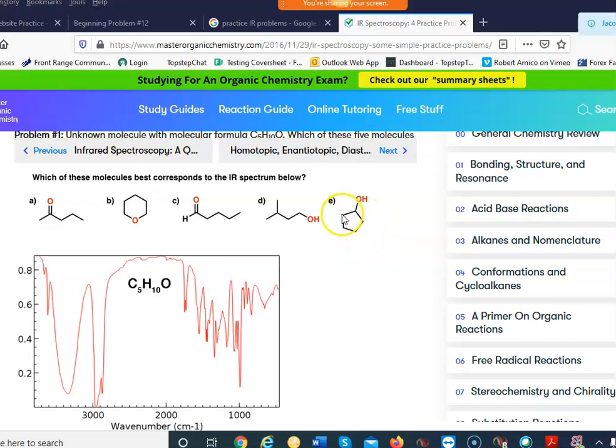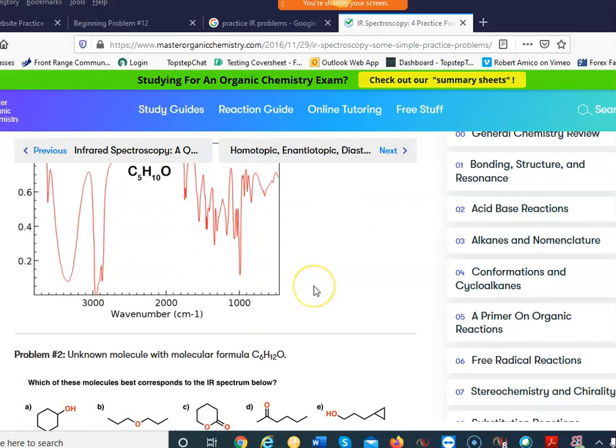It'll tell you if you have a cyclical ring, or if it's a straight chain or something like that. NMR definitely is much more powerful. Like I said, I think it's important that you guys get it, so I'm going to make the videos on it. But since I have this formula, it has to be E, knowing that we have an alcohol and it's aliphatic. And that's basically IR, all right?